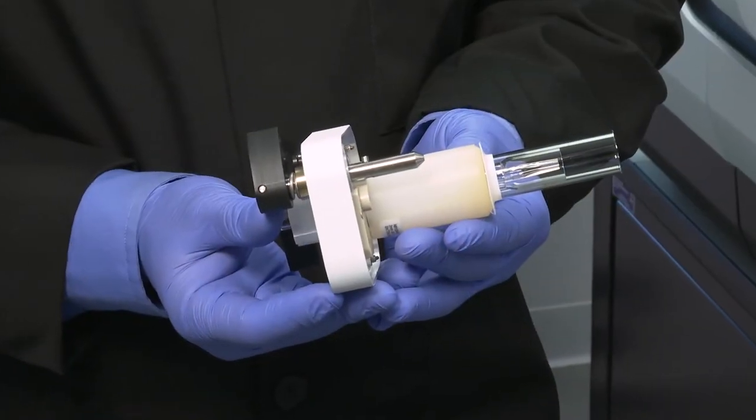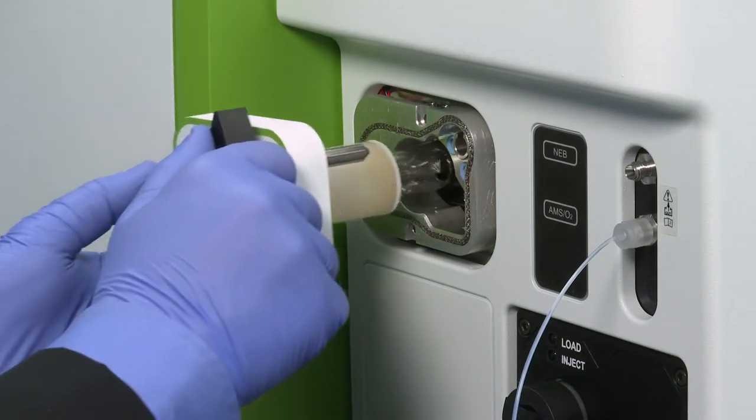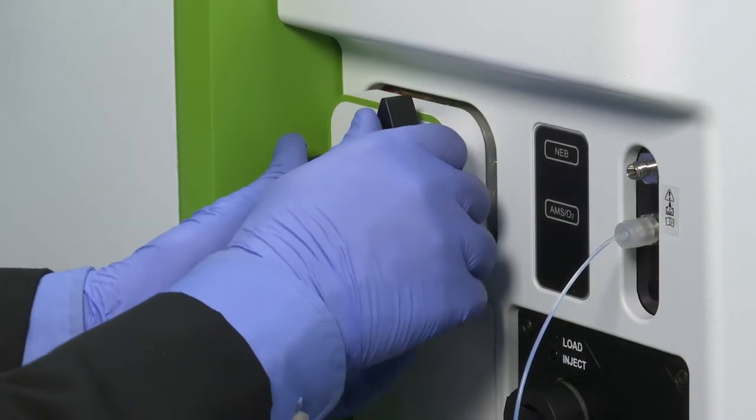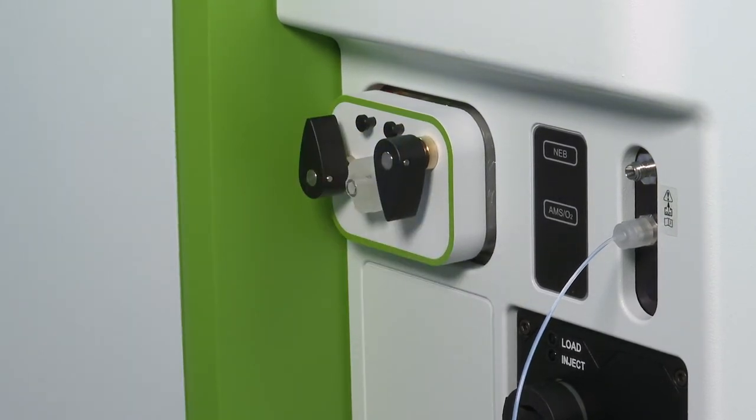The alignment pins will guide it into the correct position. Grasp the torch cassette by the knobs and slide it back into the instrument. Rotate the locking knobs 180 degrees. If they don't stop in that position, the cassette is not seated properly — readjust and try again.